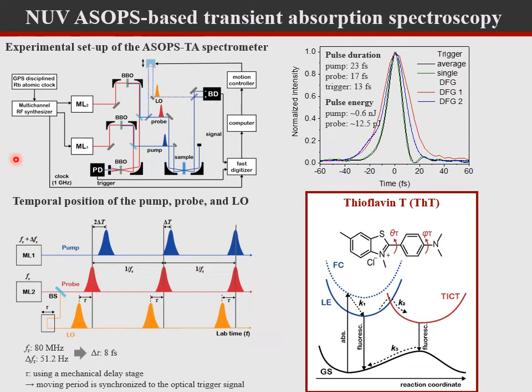Over the past 3 years, we have experimentally demonstrated time and frequency resolved transient absorption, time-resolved impulsive stimulated Raman spectroscopy, and two-dimensional electronic spectroscopy only in the near IR region. Here, both NUV ASOPS-TA and frequency-resolved ASOPS-TA measurements are for the first time carried out for ThT molecules in solution. For the NUV ASOPS-TA, the time delay between the pump and probe beams is scanned automatically.